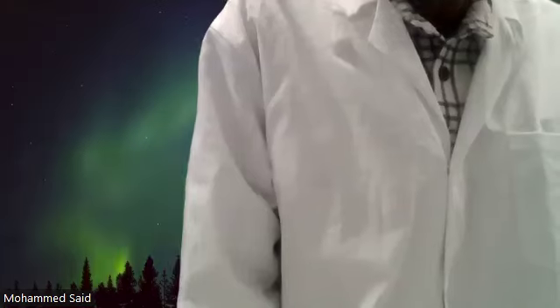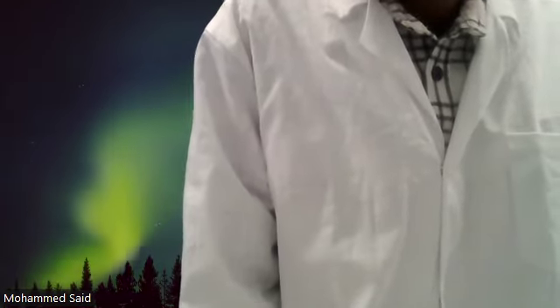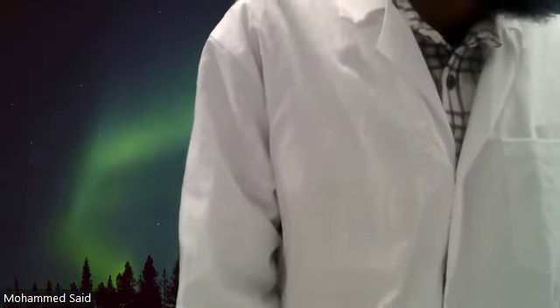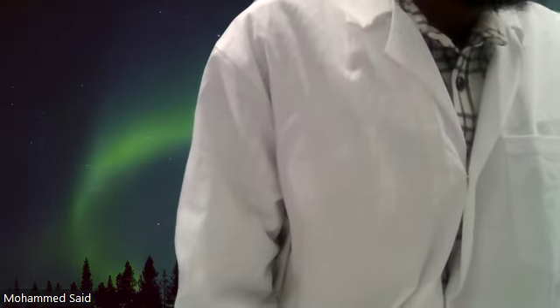I want to make sure you can complete the gram stain successfully, as it will be great prep for your unknown lab assignment when I mark your slides. So bear that in mind, everyone. Make sure that you've labeled your slides with your name or initials, the unknown, and the locations of your positive and negative controls.